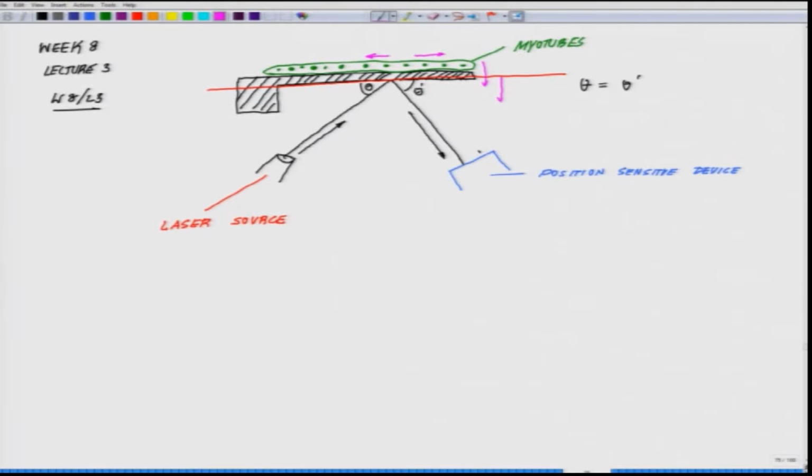They will deflect from the baseline and go back to the baseline. They will deflect from the baseline, they will go back to the baseline. While doing so, the cantilever out here will bend slightly like this. It is a very slight bending which happens in the cantilever structure. So, this is the cantilever line I am trying to draw post bending.